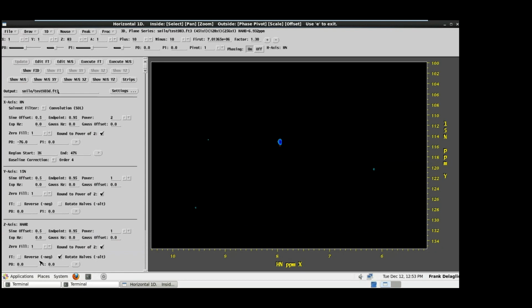I guess we can use any data sampled with any collection strategy, including Bruker MDD. That's correct. We don't have scripts to do MDD reconstruction in NMRPipe. Although the native MDD software uses an NMRPipe workflow, none of that MDD software is embedded in NMRPipe.